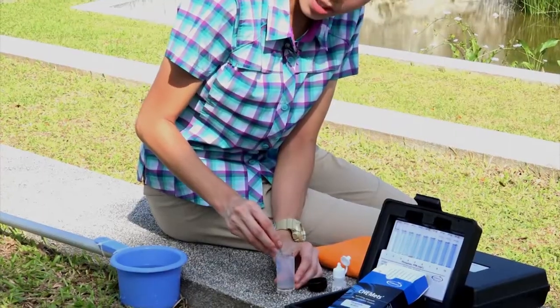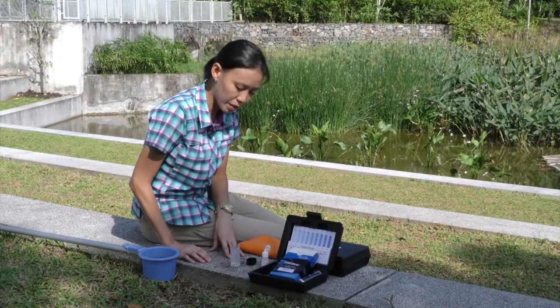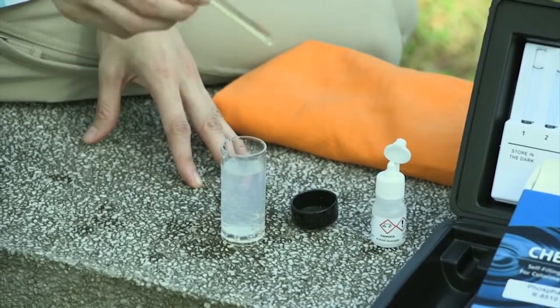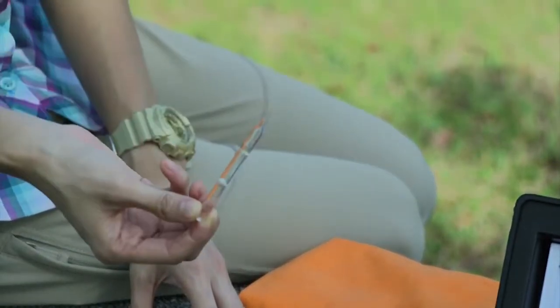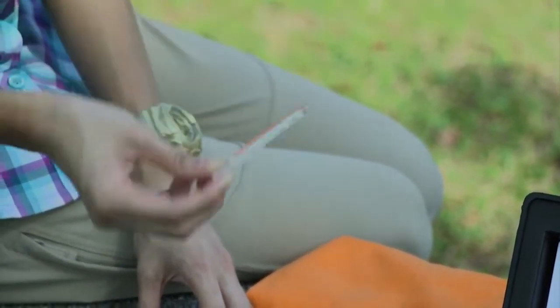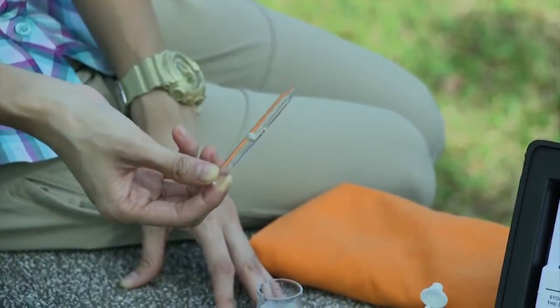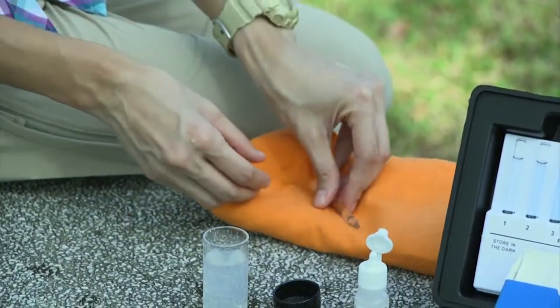Make sure that the ampule stays in the water. The ampule will fill up, leaving a bubble for mixing. To mix the ampule, invert it several times, allowing the bubble to travel from end to end. Dry the ampule and wait 2 minutes for colour development.